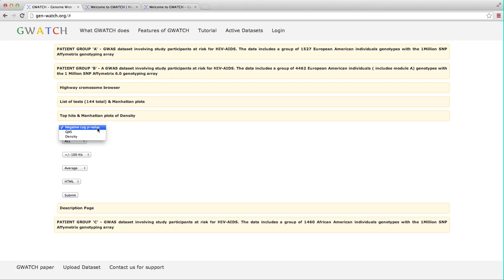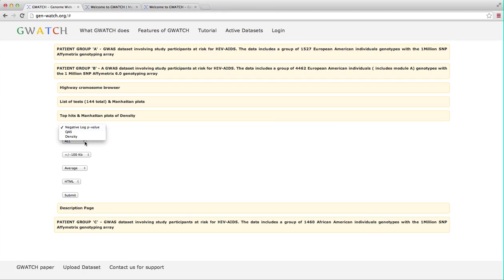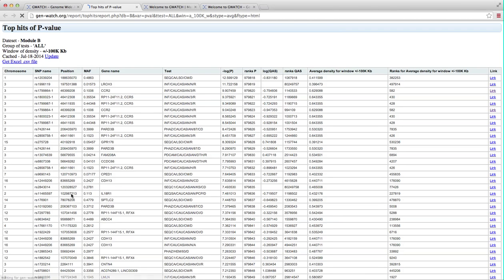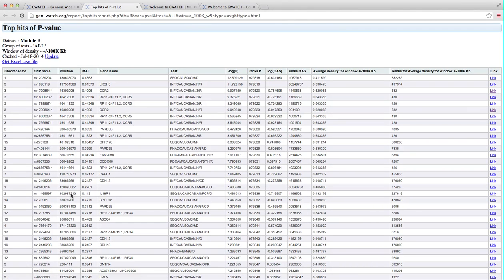The options here focus in on the details of the search for hits. For example, search for p-values, QAS or density and which stage of disease to search. Let's select here the negative log of the p-value, which is the default option. When I click submit button, a table of ranked negative log of p-values is produced, including details about the SNP hit. Its location, minor allele frequency, gene name, rank of various parameters and a link back to highway.